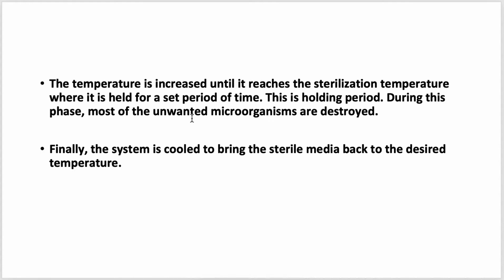The temperature is increased until it reaches the sterilization temperature, where it is held for a set period of time, and this is called the holding period. So we first increase the temperature to our set value. Suppose we want to sterilize at 121 degrees Celsius, we increase the temperature to 121 degrees Celsius and keep that temperature for some time. This is called the holding period.